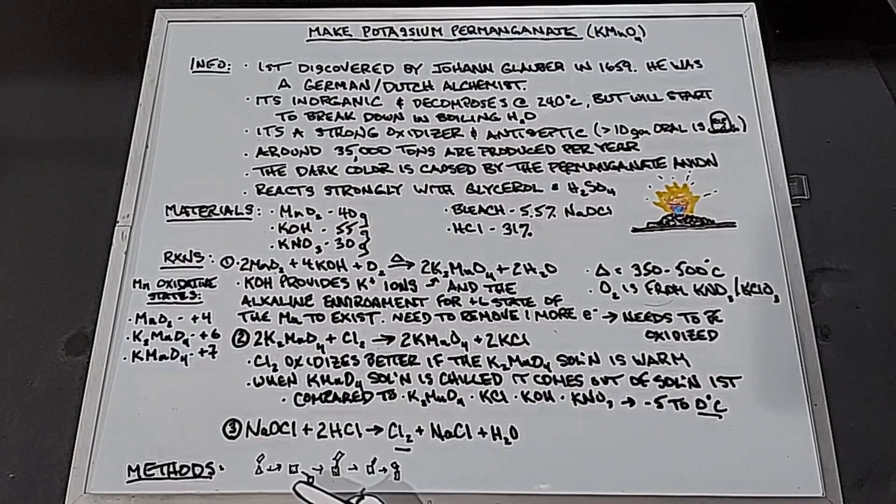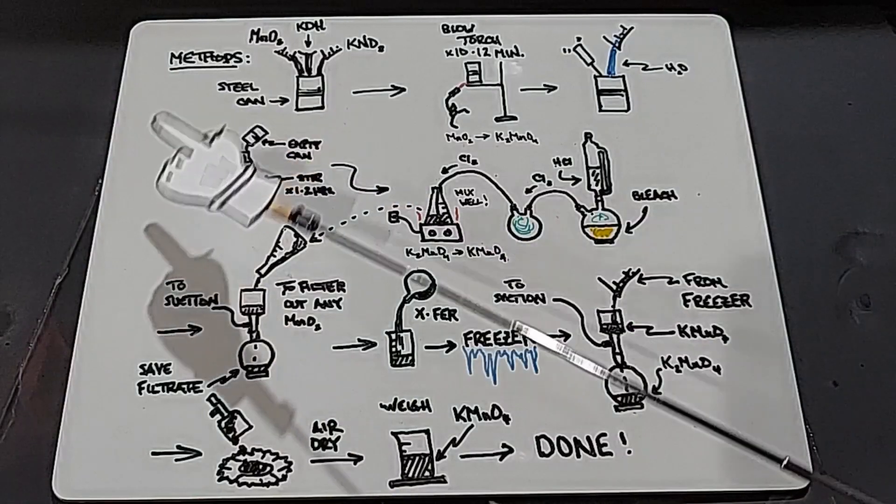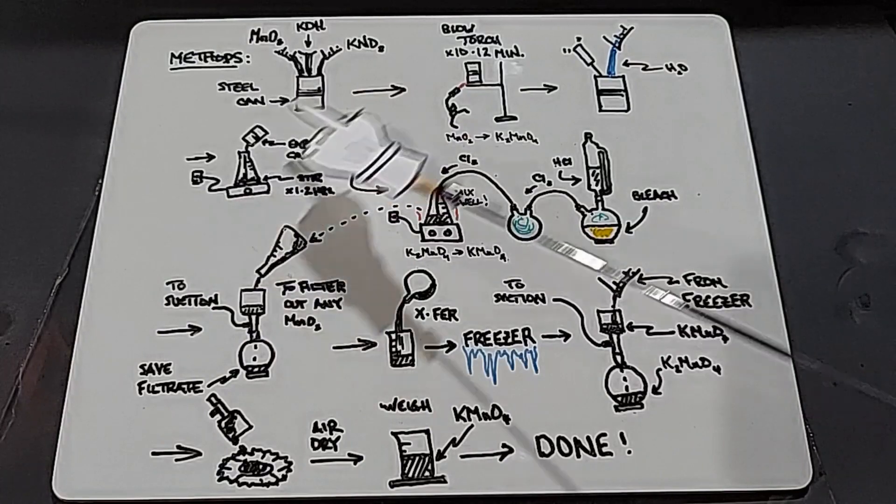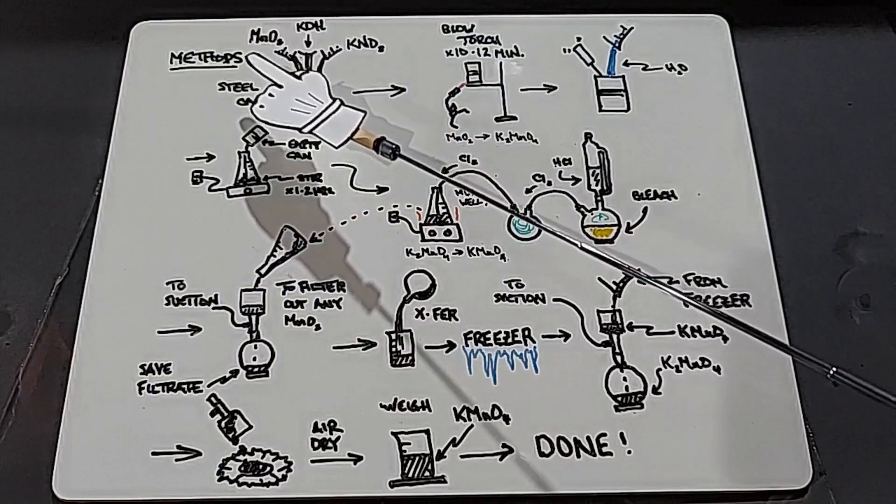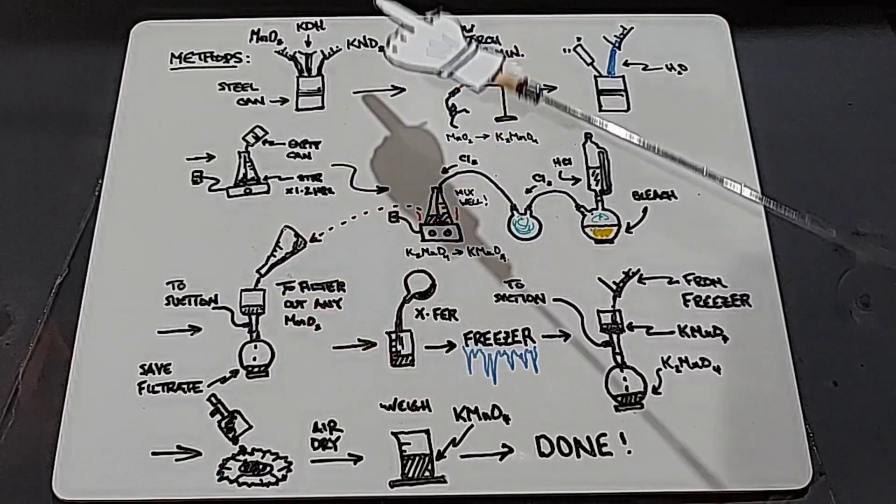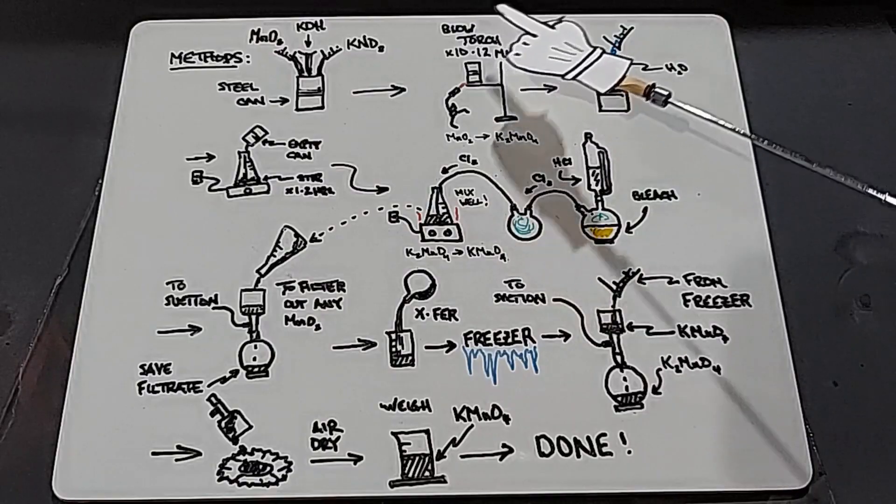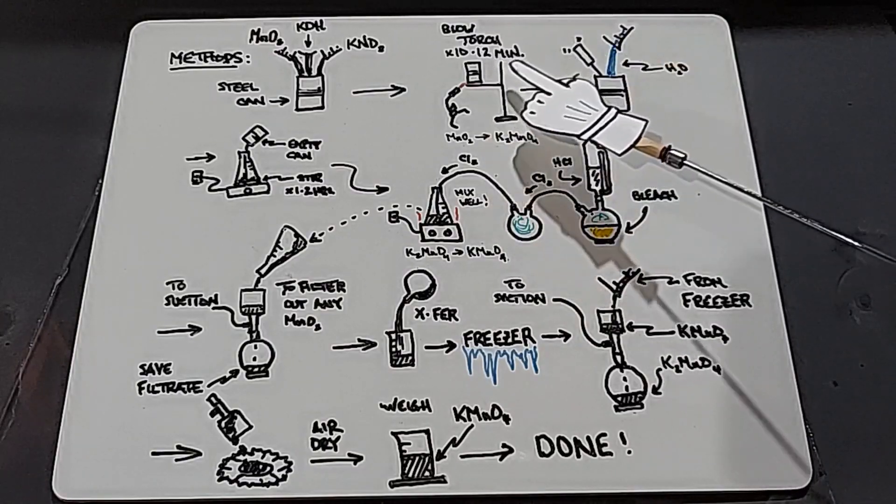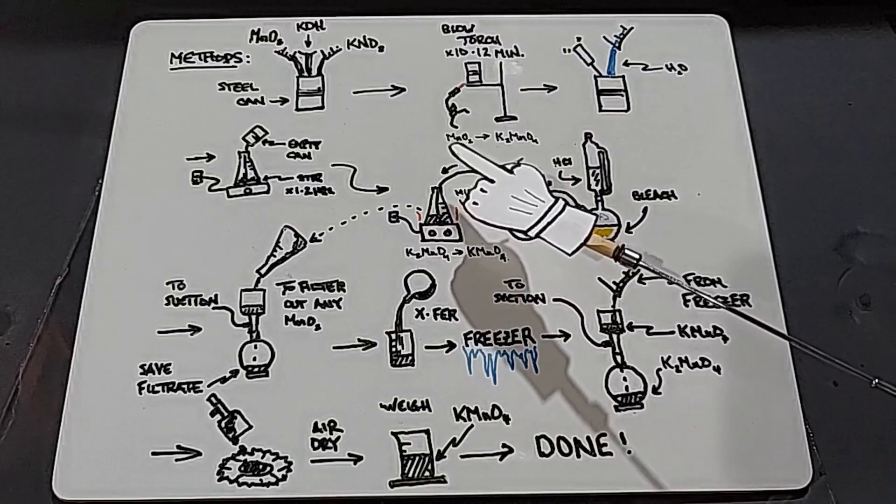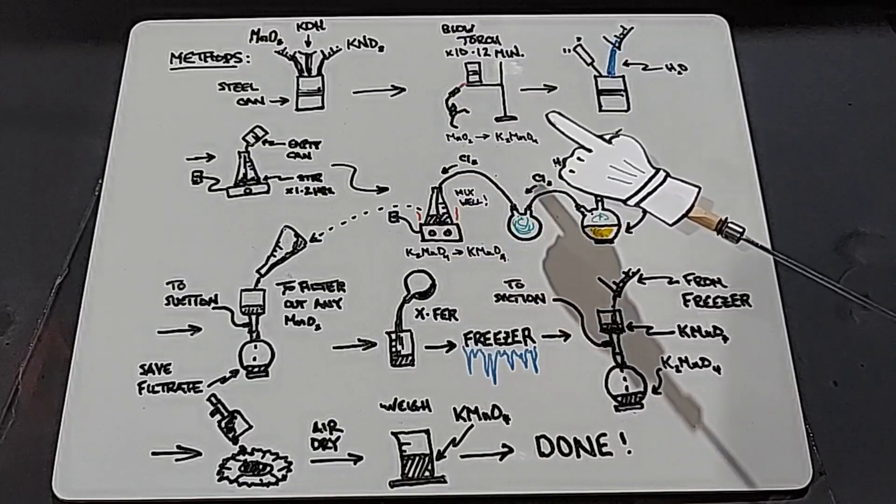In our methods, we need a steel can. We're going to put the manganese dioxide, potassium hydroxide, and potassium nitrate in there. Mix it about good. Then I'm going to blow torch it for at least 10 to 12 minutes at high heat so that this is red hot. At this point, the manganese dioxide is becoming potassium manganate.